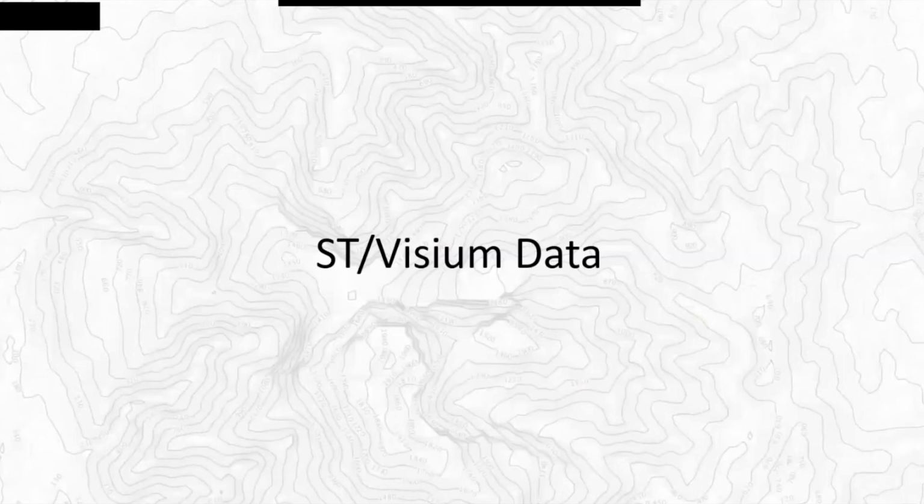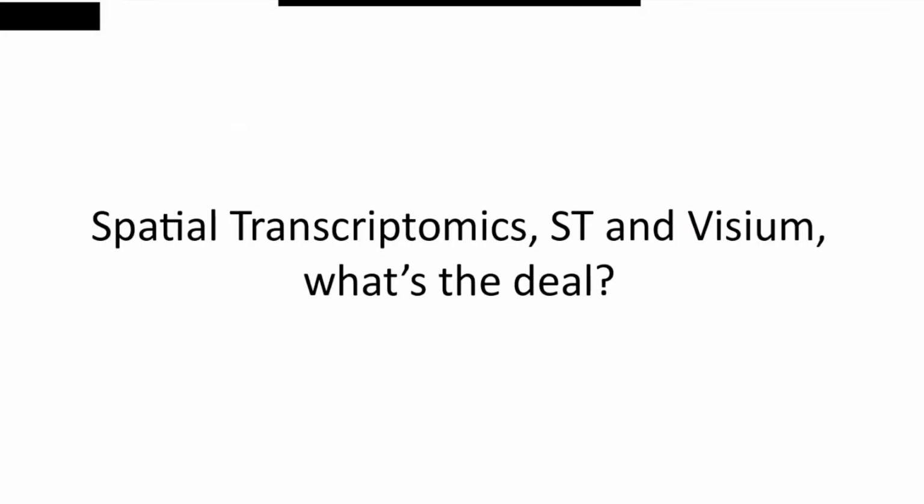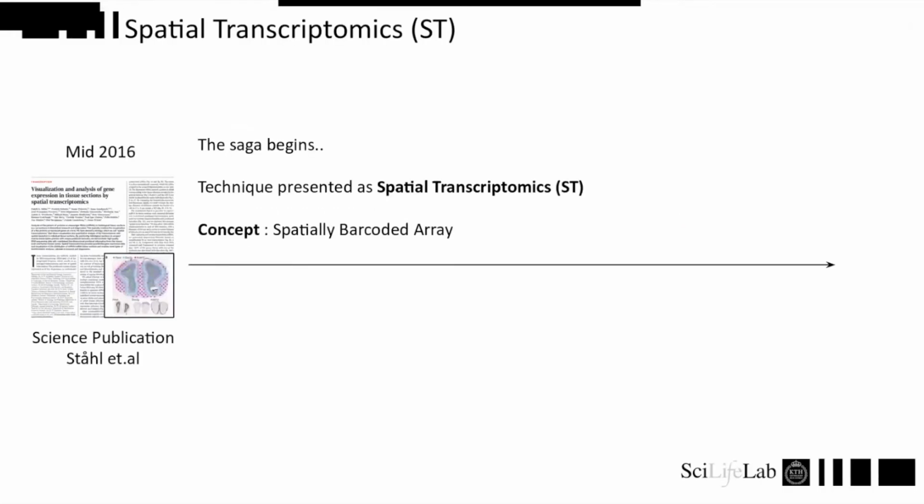Moving on to the ST or Visium data here, I wanted to give a bit more information about it. Like I said, there is some confusion here regarding the terms spatial transcriptomics, ST, and Visium. So I just wanted to give a bit of a backstory to this.